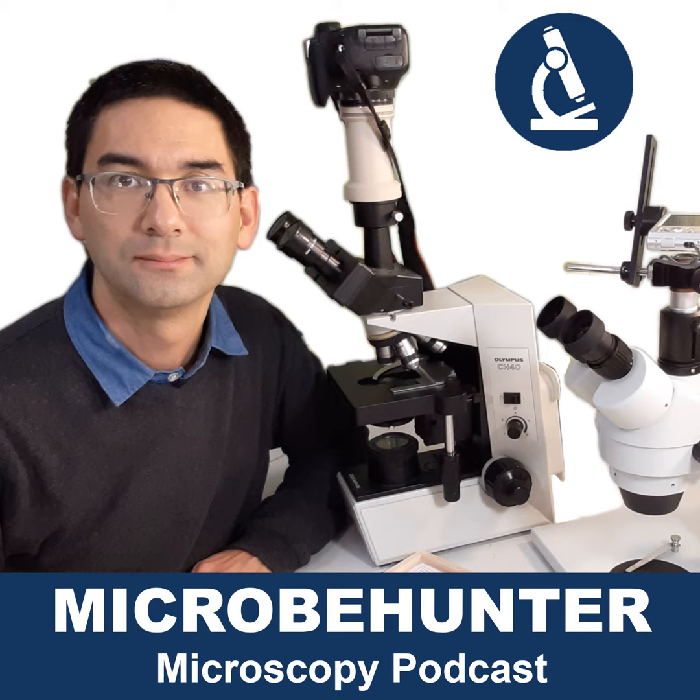So immersion oil should only be used with a 100 times oil immersion objective, and the objective has the word oil written on top of it. For those of you who don't know, the oil immersion objective is made in such a way that it can be rotated directly into the immersion oil. This means that the objective itself will be covered with immersion oil. This immersion oil has the correct refractive index. It's placed on the microscope slide, and this increases both the brightness and the resolution, but it can only be used for the oil immersion objective.